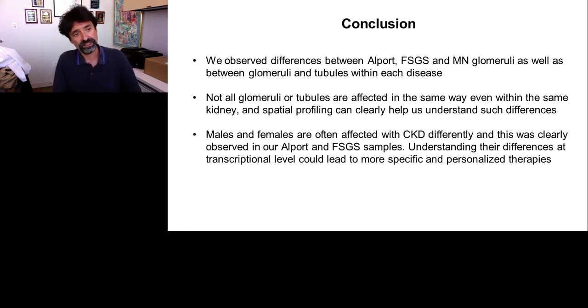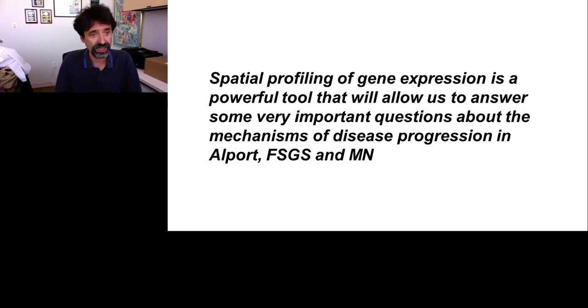So in conclusion, the spatial profiling of gene expression, we think, is a powerful tool that will allow us to answer some very important questions about the mechanism of disease progression in glomerular diseases and CKD, such as Alport, FSGS, and membranous nephropathy. Thank you for your attention.